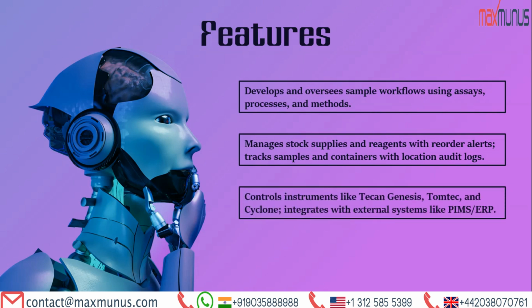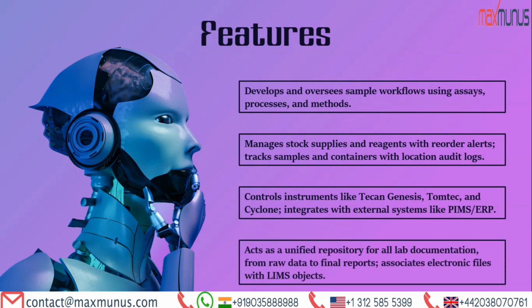Controls instruments like Tecan Genesis, TomTec and Cyclone. Integrates with external systems like PIMS or ERP. Acts as a unified repository for all lab documentation from raw data to final reports. Associates electronic files with LIMS objects.